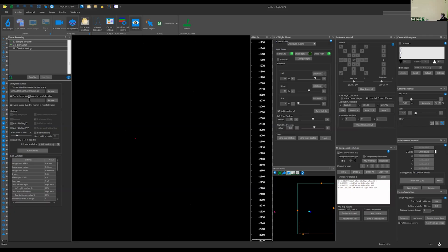Our CopyFile software behind the scenes will come in and take that file and copy it to your network attached storage device or other storage location. We then also have a setting that allows CopyFile to actually go back in and delete the file off of that local drive, freeing up space for the rest of the acquisition. For this acquire, though, I'm just going to acquire to the actual local save directory.